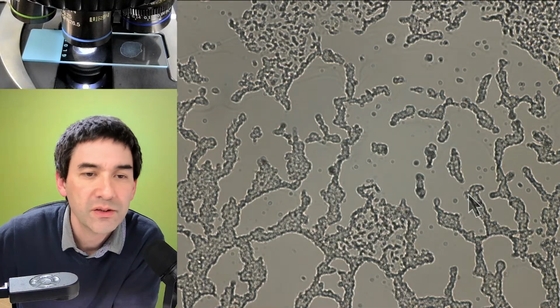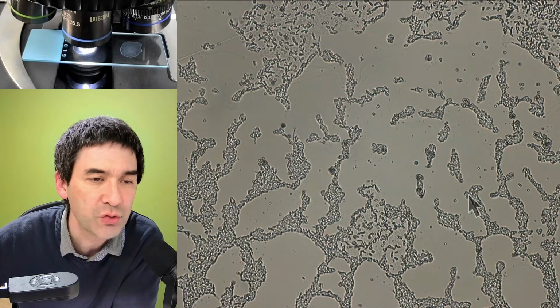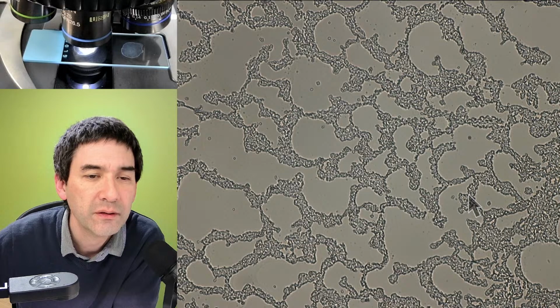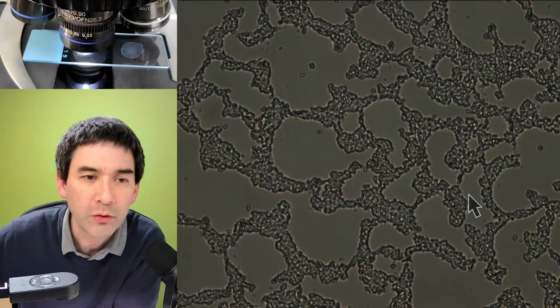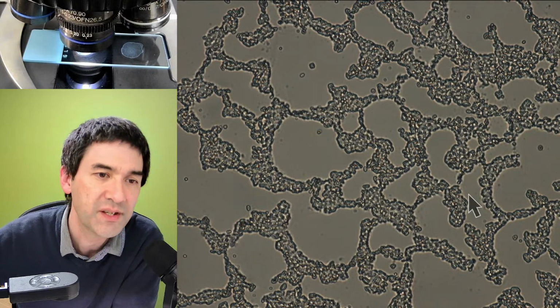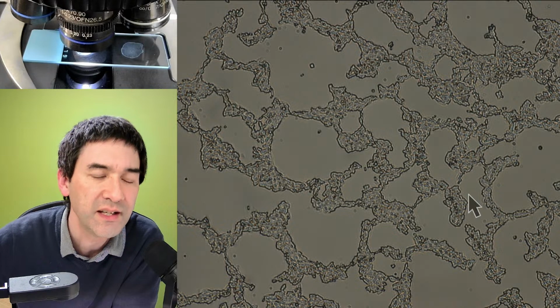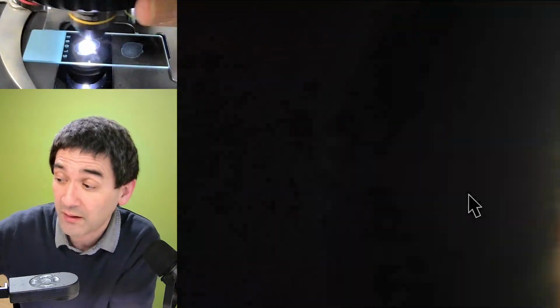Okay. So that's all. By the way, I removed the DIC filters and so on. So that's just regular bright field. And I don't know if both of them are gram positive or gram negative. So we're going to see. It's a little bit a question of luck. You see how the cells are sticking together? They're barely distinguishable. So doesn't matter. I hope that they're different, or at least that they're a mix.